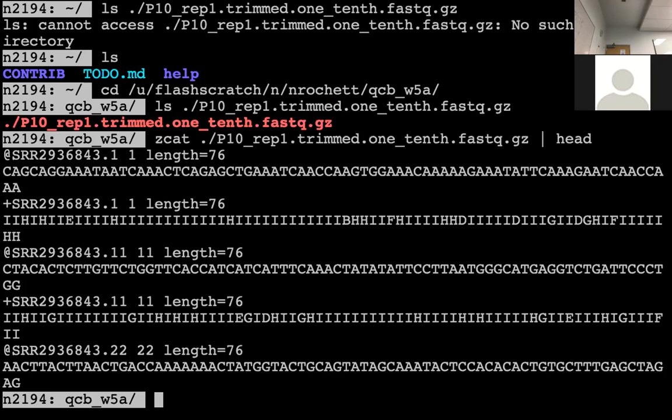Permission. Yes. Anytime you see permission denied like this, every time I've seen a permission denied, people were trying to write into my scratch space, because they're not allowed to. On Unix, you have multiple users, each with their own scratch space, and they can't visit each other's scratch space. The only scratch space you can write in is your own. So you need to go to your own scratch space and copy the FASTQ file over there.